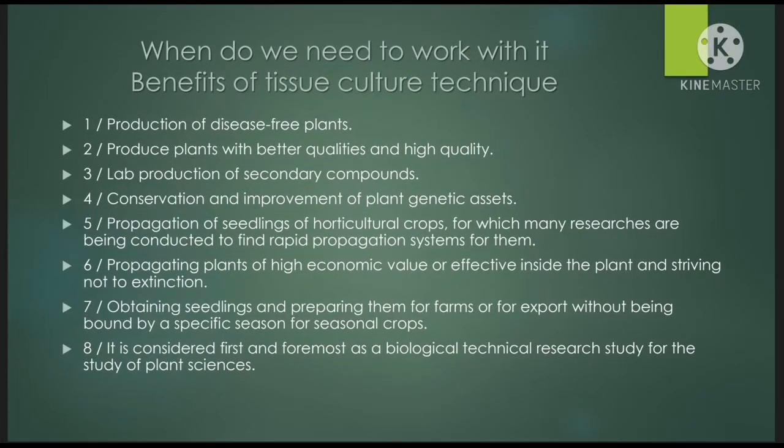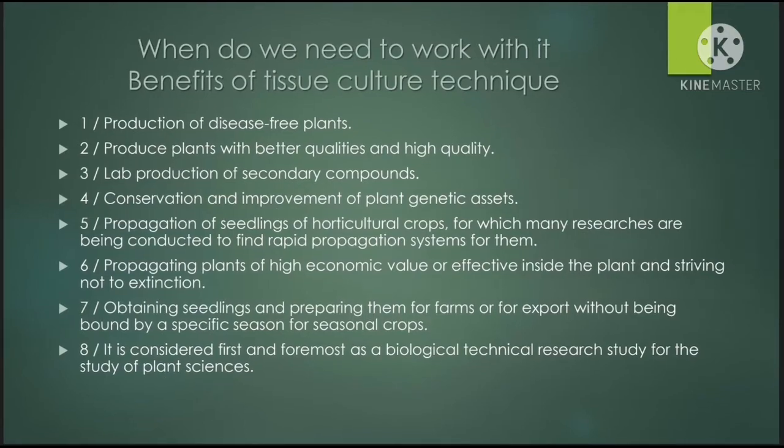When do we need to work with it? Benefits of the tissue culture technique: production of disease-free plants, production of plants with better and higher quality, lab production of secondary compounds, conservation and improvement of plants' genetic assets. It is considered first and foremost a biological technical research study for the study of plant science.